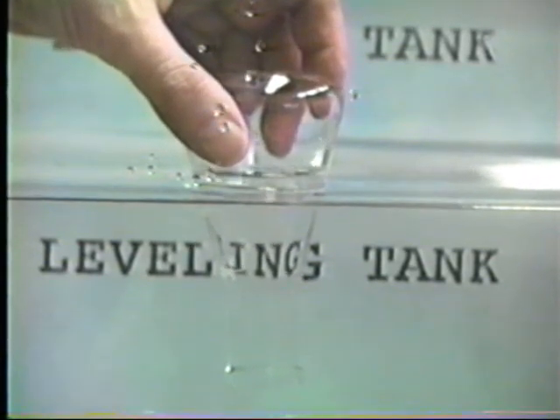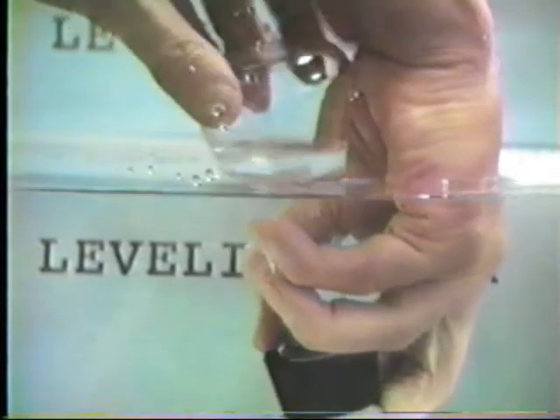Once we have the pressure inside this flask exactly at atmospheric pressure, we simply have to put a stopper over the bottom here and then just raise it up out of the tank, and that's the end of the experiment.